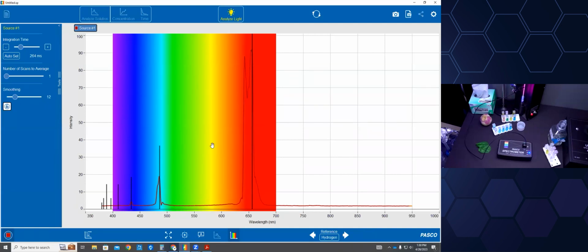But if I wanted to, I could move my entire reading with this tool here, the calibrate wavelength tool. So let's say it looks like I'm just maybe 1 nanometer off. Let's go to the left and see what direction that goes. Look, it moves it to the left. If I go to the right, it moves my whole signal to the right. So if I want perfect alignment on that first peak there, a little bit more, whoops, too fast. There we go. That's pretty good.